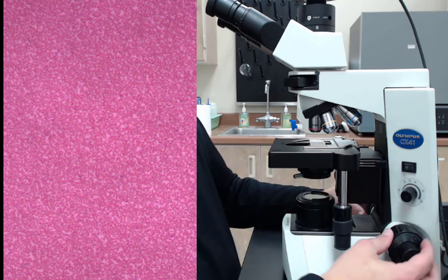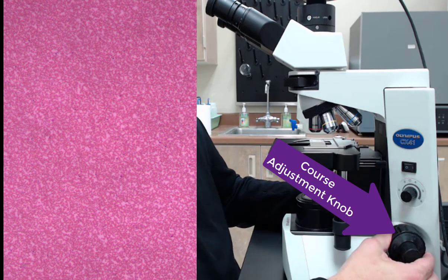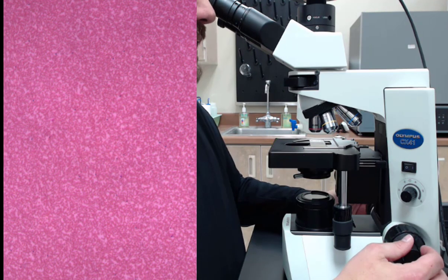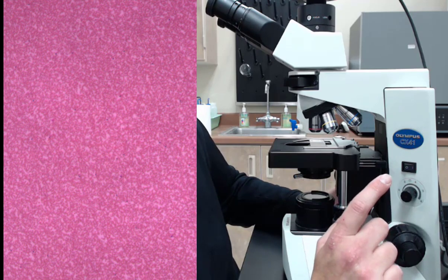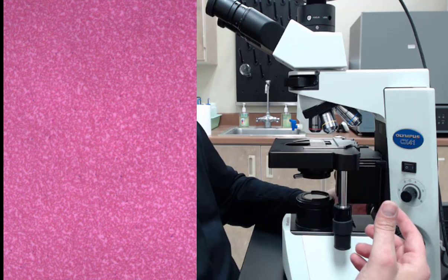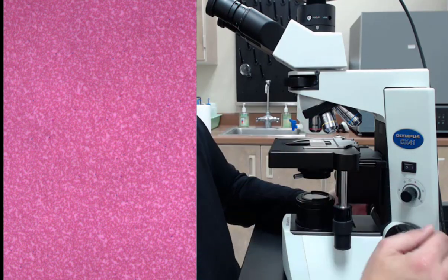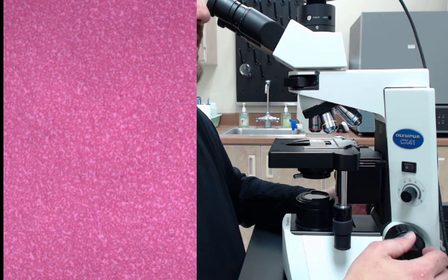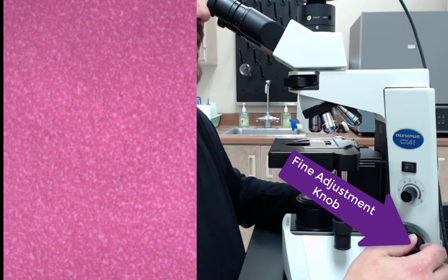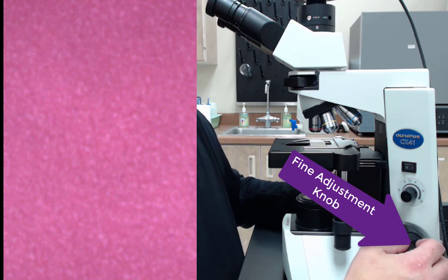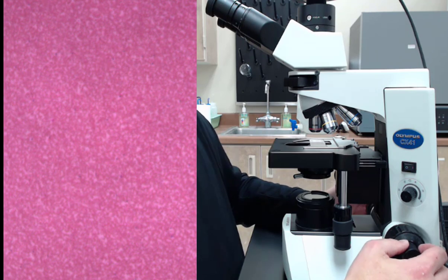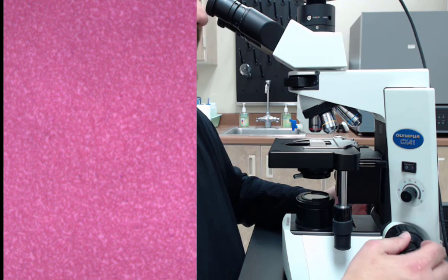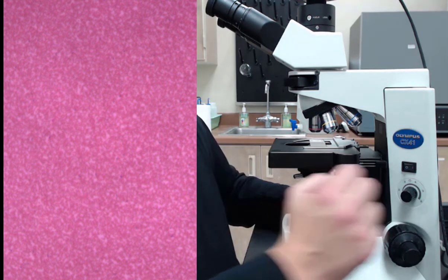So what I did there is I got it in focus using this here, the course adjustment knob. It's how you move it large distances, as you can see here. Sorry for the psychedelics there. But then now that I have it where I think it's in focus, the key here with this, with what's called a parfocal microscope, especially where the objectives are linked together, the key is to make sure it's as close to 100% in focus as possible. So I will actually, I call it the Goldilocks strategy. I will actually purposely take it so I think it's in focus going in one direction. I'll purposely go too far, take it out of focus, and then I'll go back. And the reason I do that is because if it's only 90% in focus, it'll probably look pretty good at this lower magnification. But as we move up, I'll be farther and farther away from actually having it in focus.